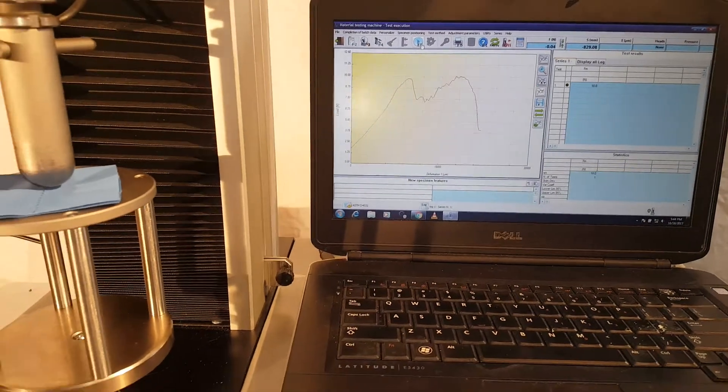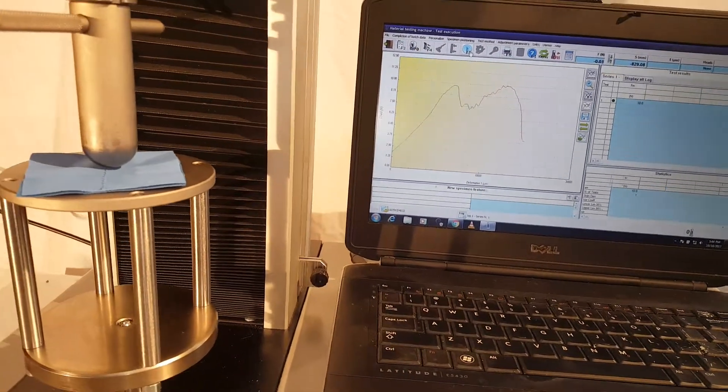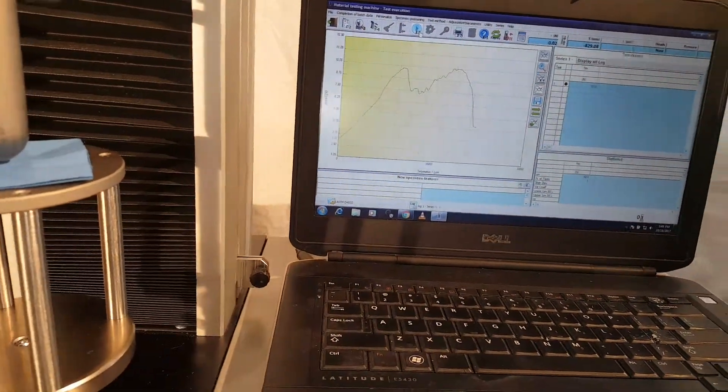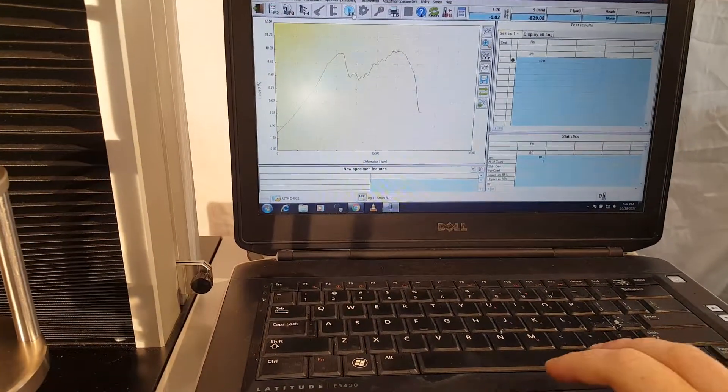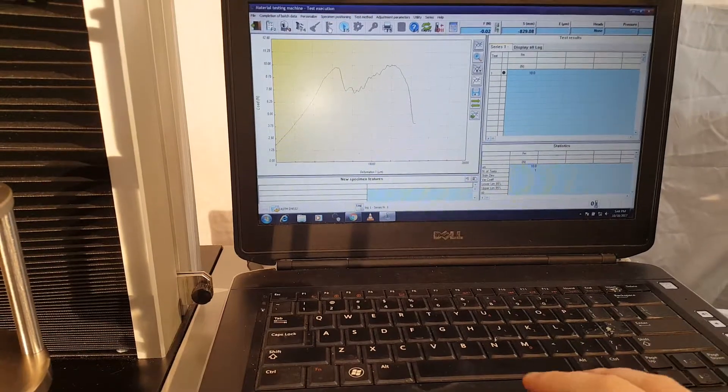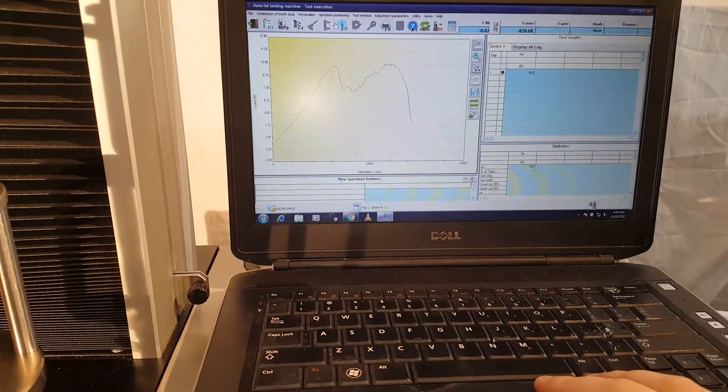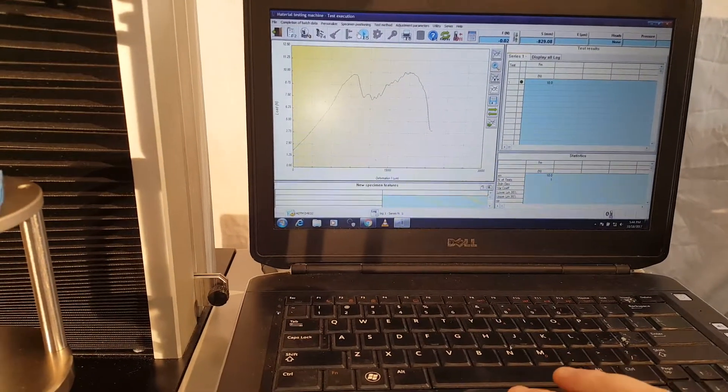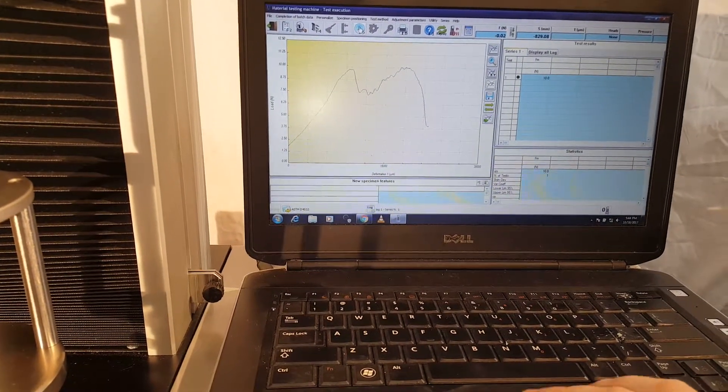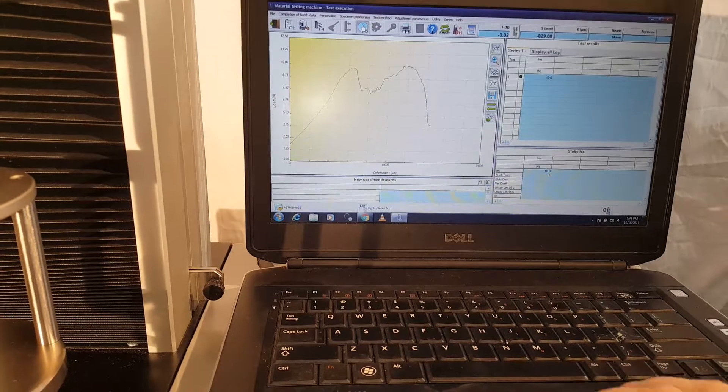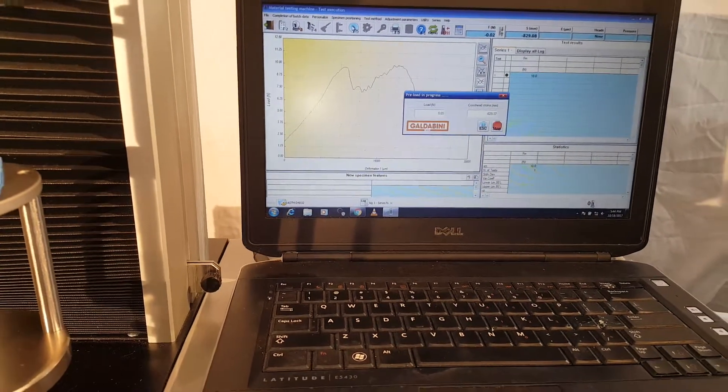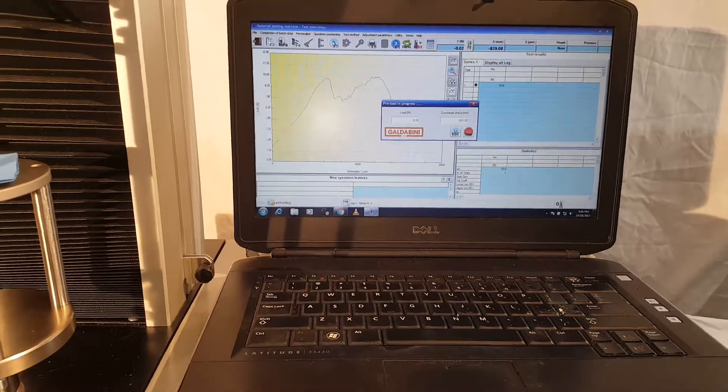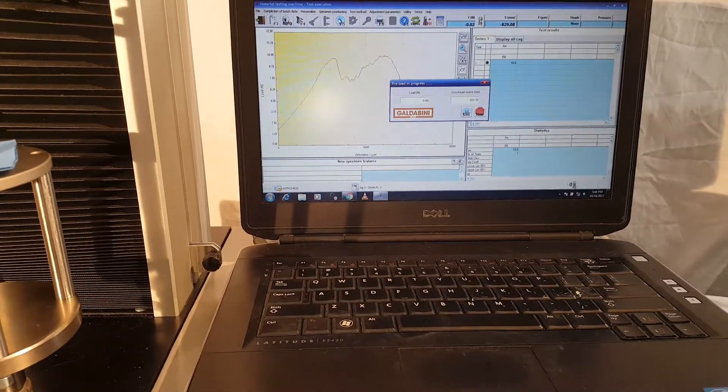If we want to do another test, we could just load another sample and play that back again. All right. So again, we're doing the preload.